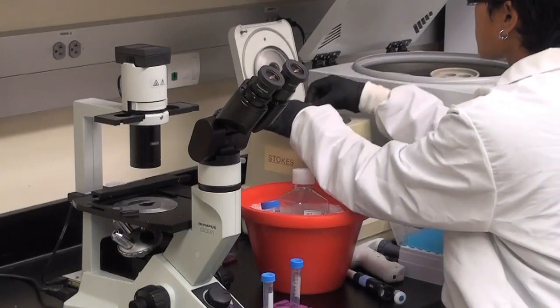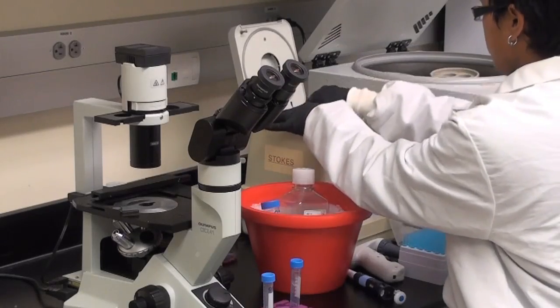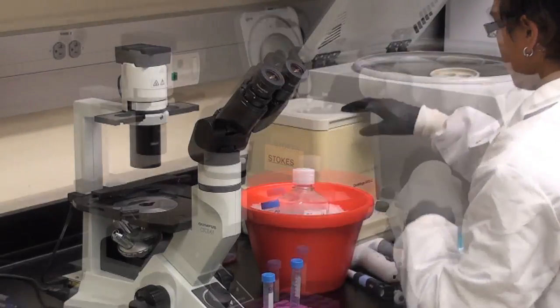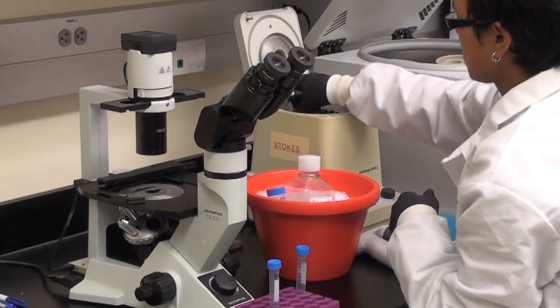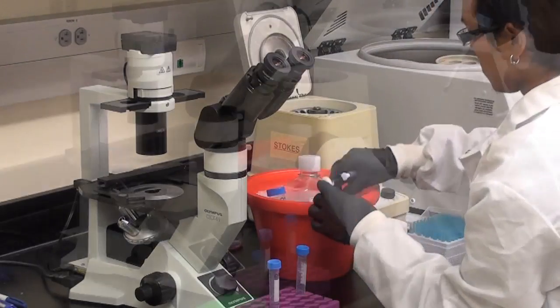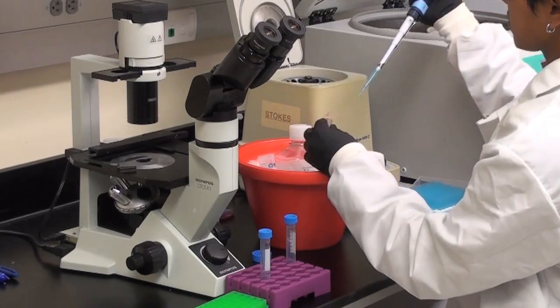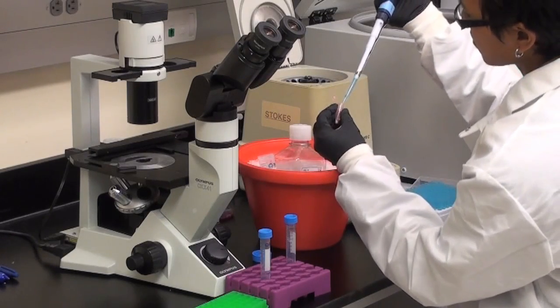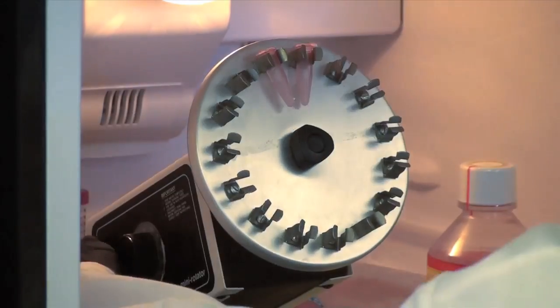Place the small spin tubes into the micro centrifuge and spin them at 12,000 rpm for 1 minute. Once complete, place the tubes directly on ice. Aspirate the supernatant and add 350 microliters of lysis buffer, and completely re-suspend the pellet by pipetting up and down 3 to 4 times. Rotate the tubes at 4 degrees Celsius for 30 minutes.